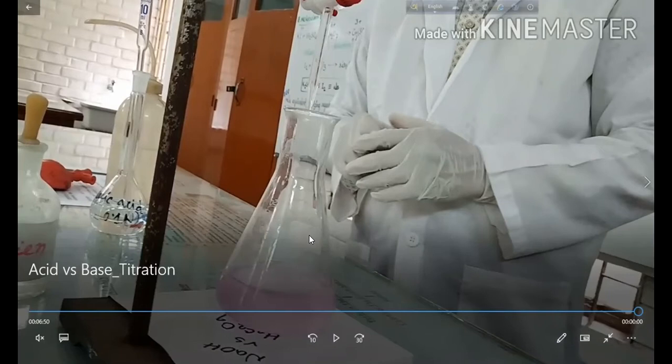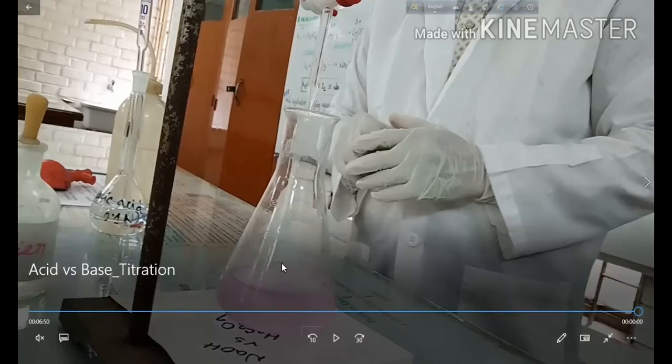Suppose initially the burette reading was 5, and after the end of the titration you have found that the burette reading is 20 milliliter. So 20 minus 5 is 15. So the total volume required to titrate the oxalic acid is 15 milliliter.